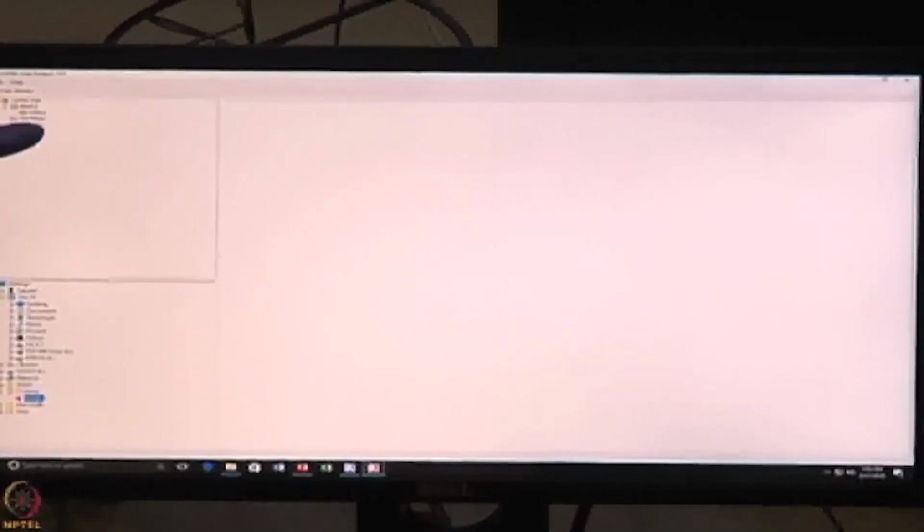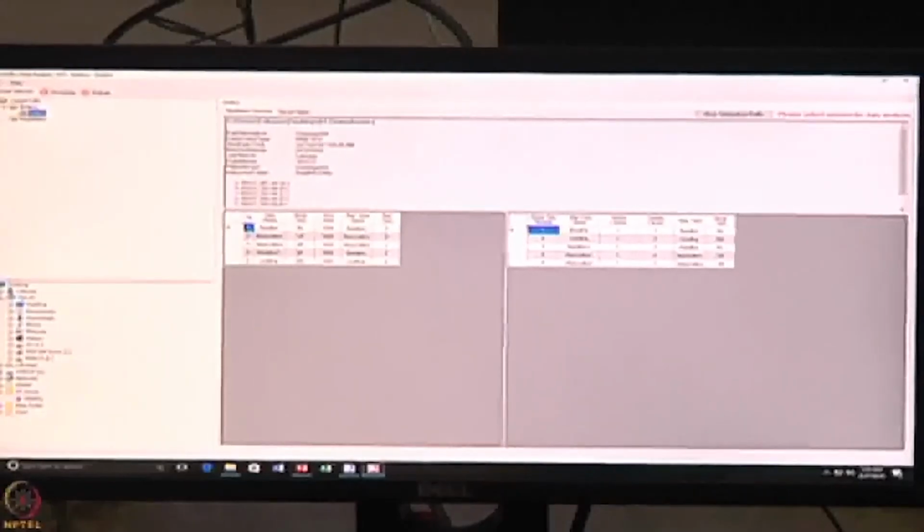mode. So we have a quantitation mode. If you run an experiment in quantitation mode, the data will open in the quantitation. If it is kinetics, it will open in the kinetics. So I will click on this. Okay, this is how the data gets opened.